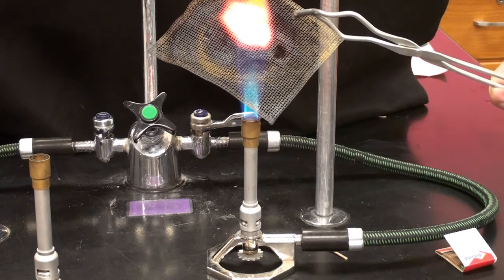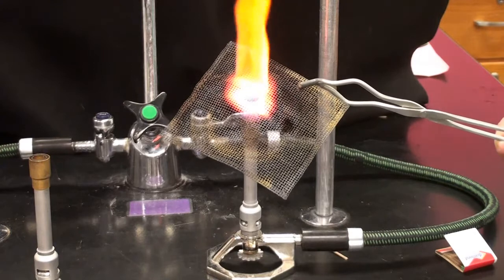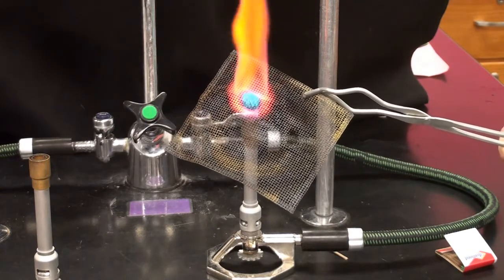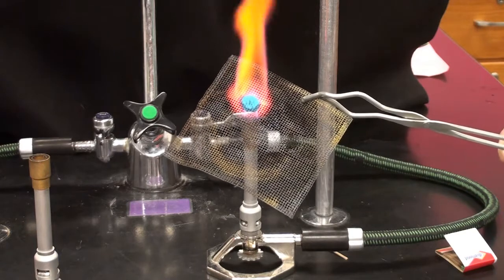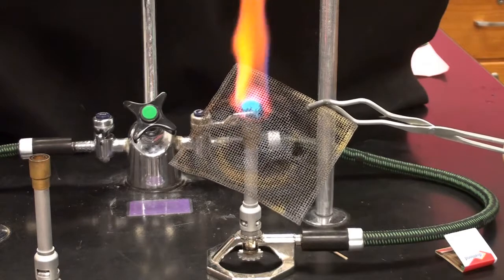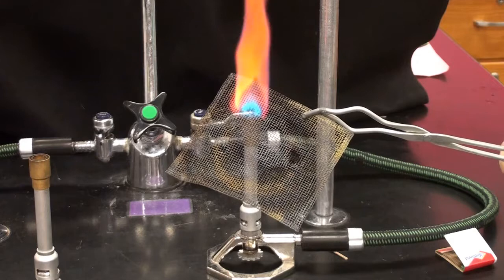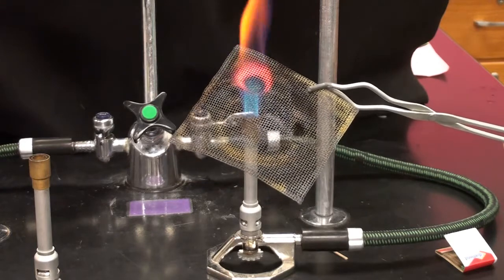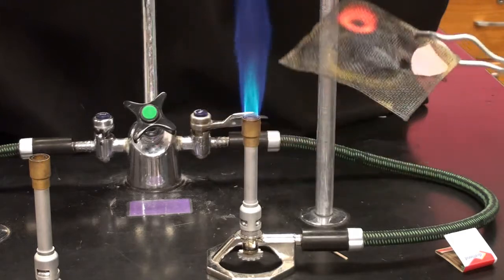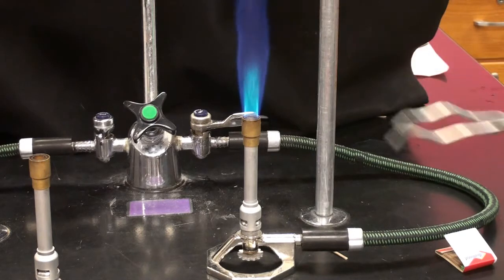When I had that air intake closed, let's see what happens when I bring it down a little bit. Now, do you see how it looks more like a donut, right? If I bring it down a little bit here, I'm getting it so it's not as hot on the inside, right? So inside that blue cone on down, as I go lower, it's not glowing as much, and there's a sort of a circle where the inside's not as hot. So I want to be above that. That's the hot part, above that blue cone.